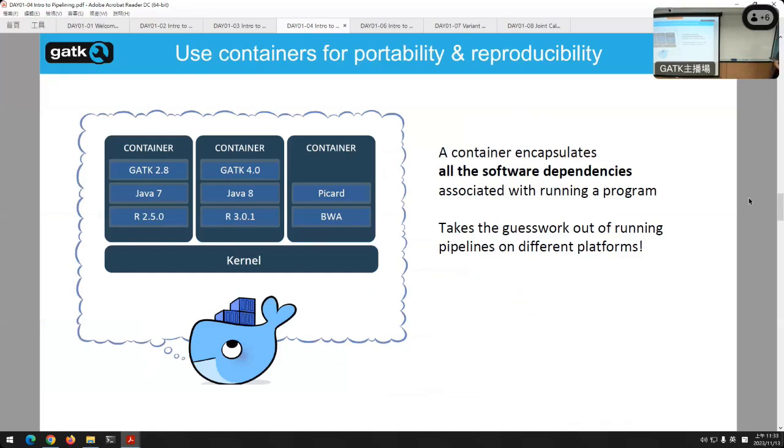The benefit of using a container is that everything is already installed in that environment. It's an environment that is ready to use every time that you want to run your tool. It's also an environment that is reproducible and shareable with others. So your colleague can use the same Docker container and have the exact same versions of the software and get the same results as you do. So it's helpful for reproducibility and sharing, as well as just making it easier for you to install things.